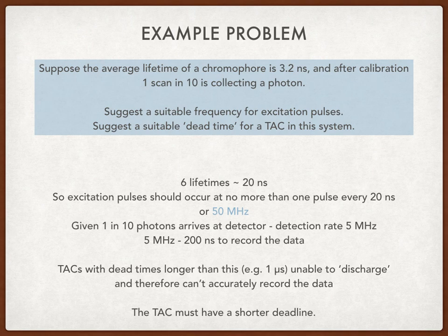Anything shorter than 200 nanoseconds would be good, but let's say a TAC with a dead time of 120 nanoseconds, which just happens to be a TAC I've used in the past, or anything shorter would be suitable.